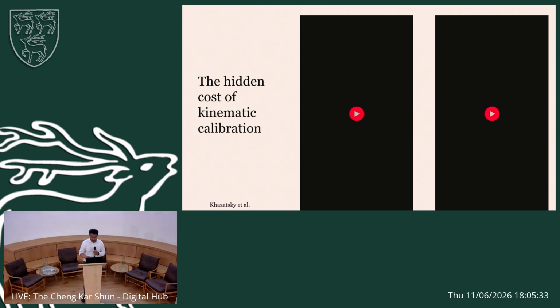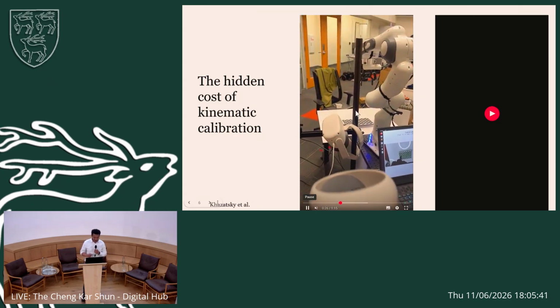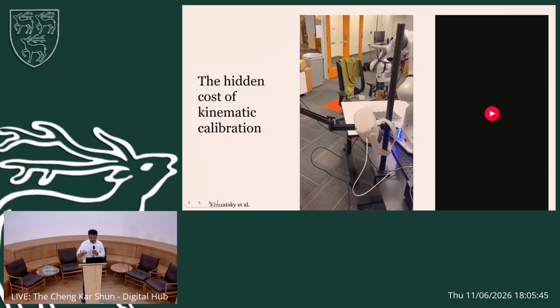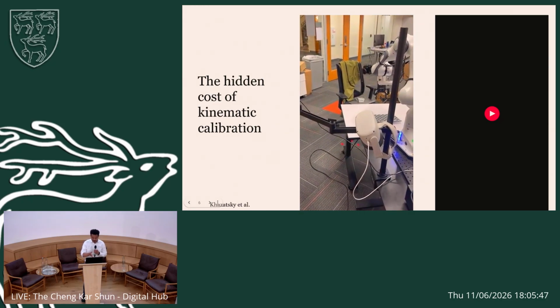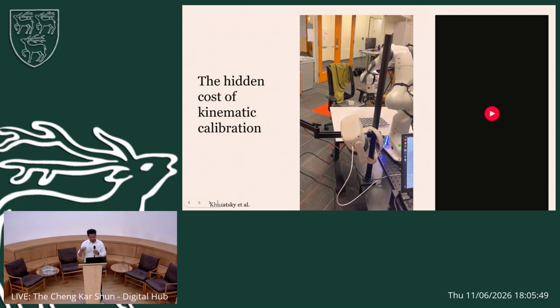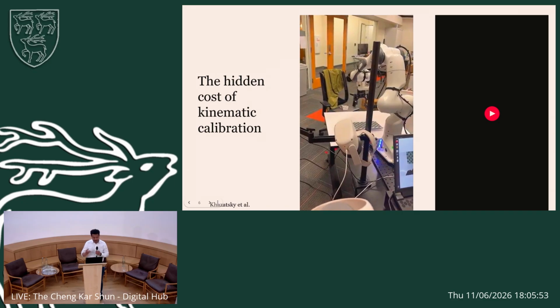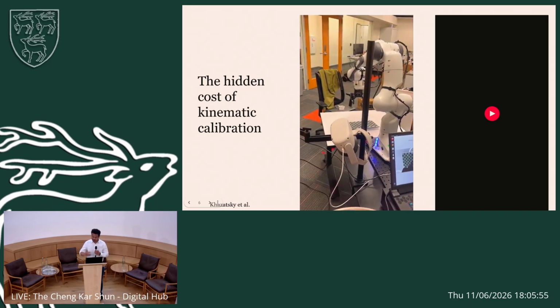And what that means is that in the setup of this environment, you'd have manual work of creating the correspondence between the 2D view and the 3D robot. On the video here on the left, we're seeing the intrinsic calibration of the camera that's on the robot, which is understanding how things project into the camera.